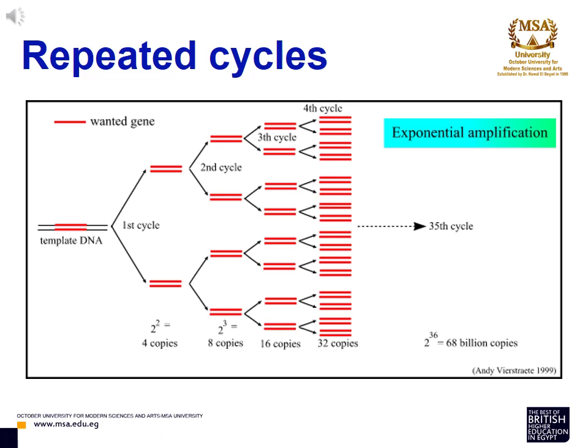And finally, the cycles will be repeated, in which the next cycle will begin by denaturing the new DNA strands formed in the previous cycle.